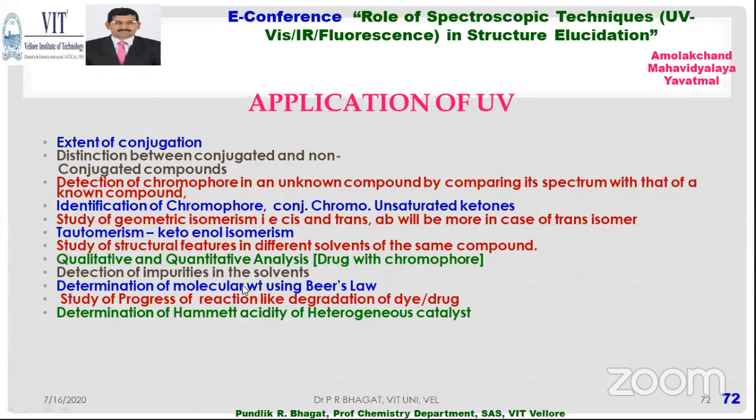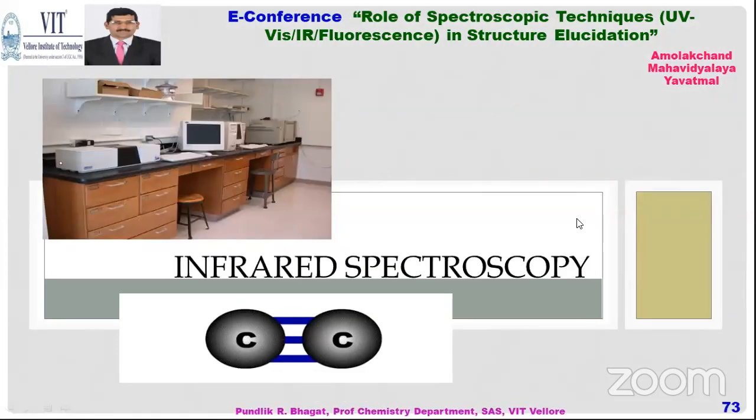Similarly, we can find out impurities present in the solvent. Molecular weight can be determined by using Beer's law. So these are a few applications which I mentioned. Now I will shift over to infrared spectroscopy.